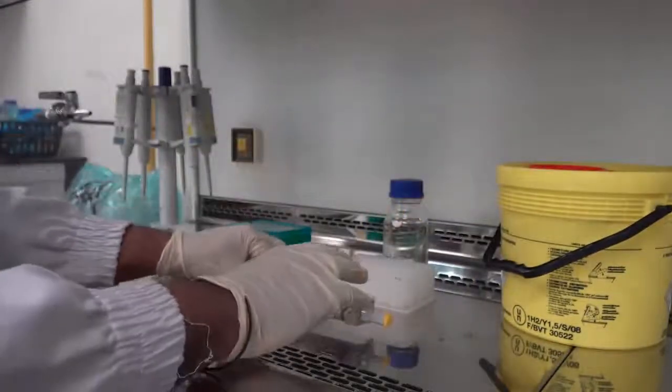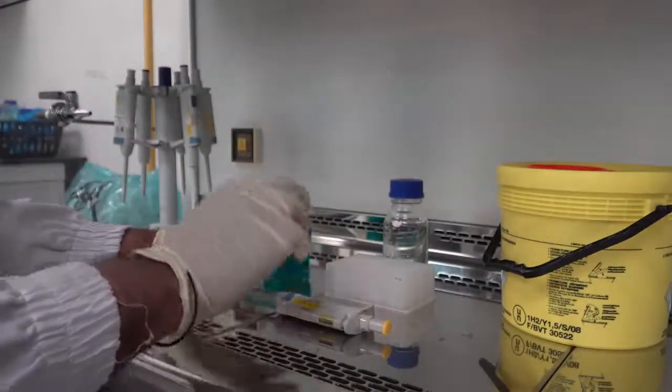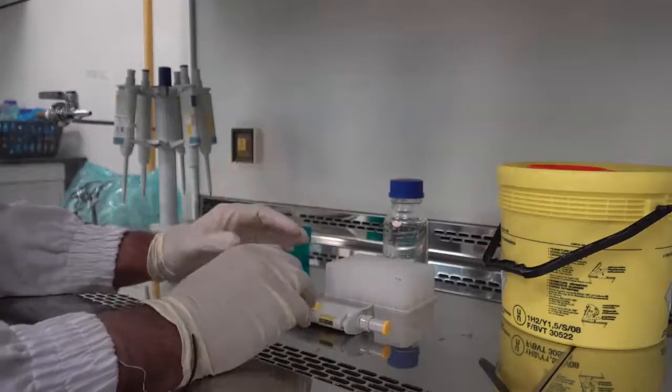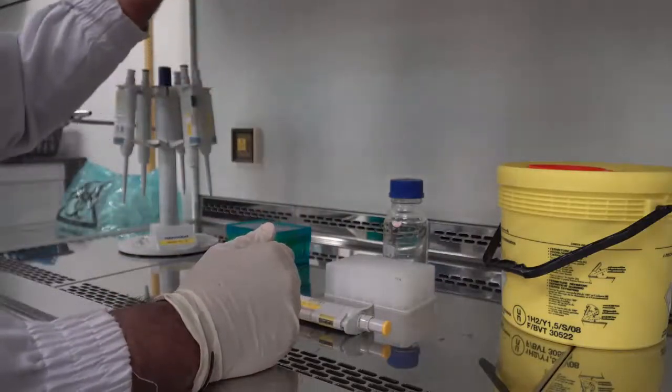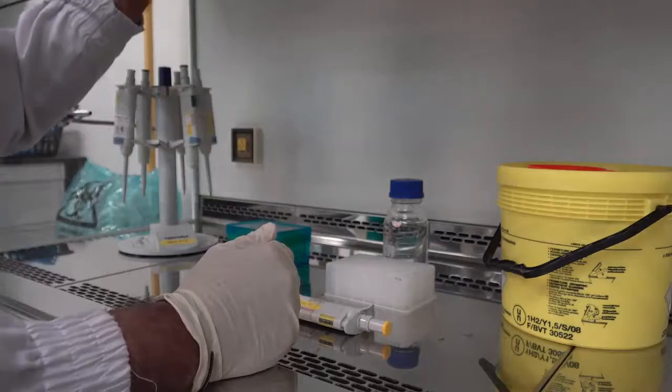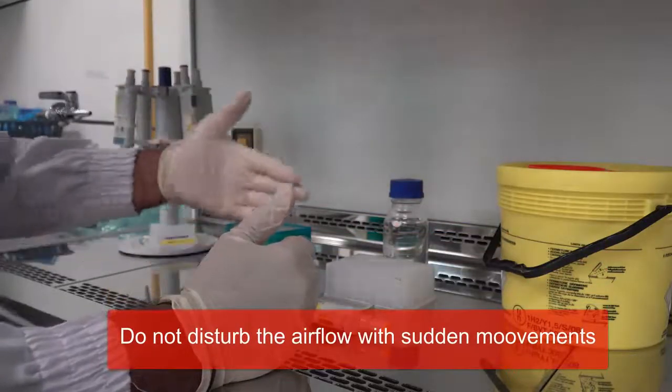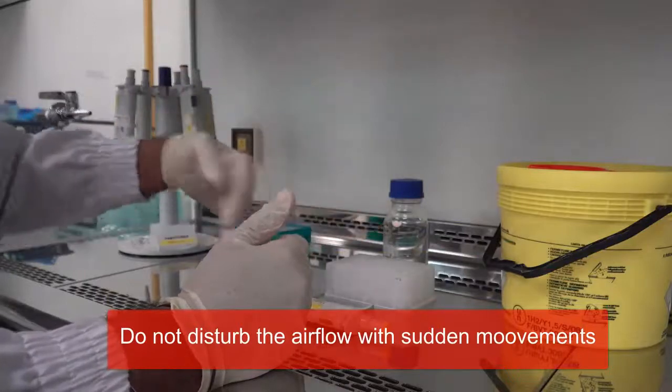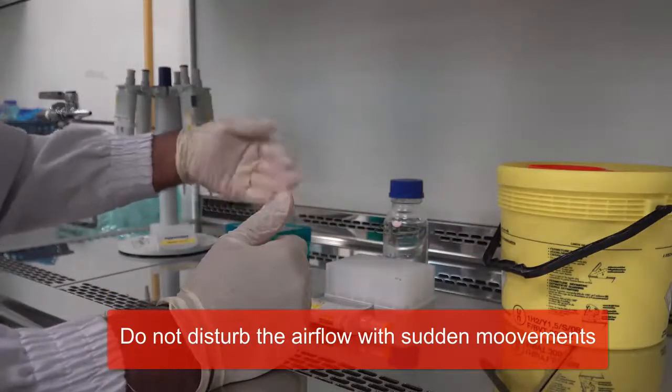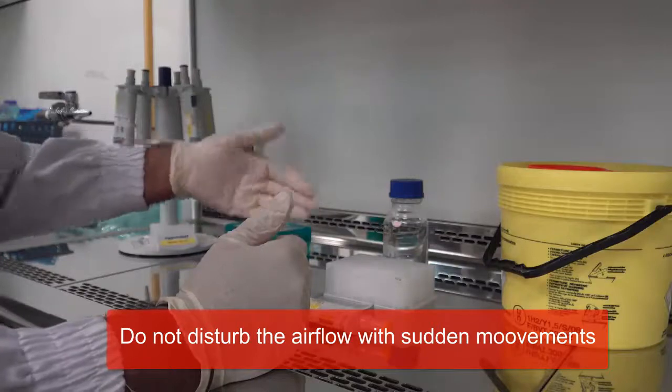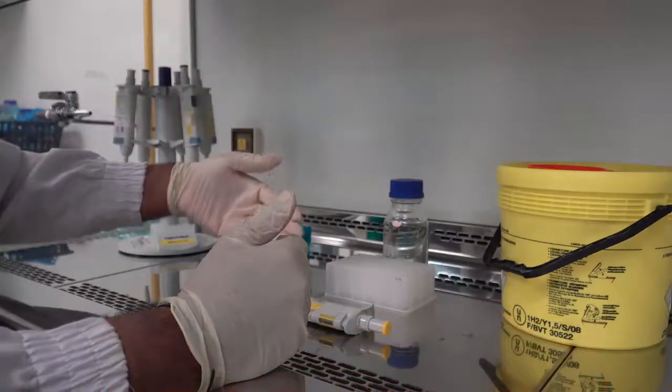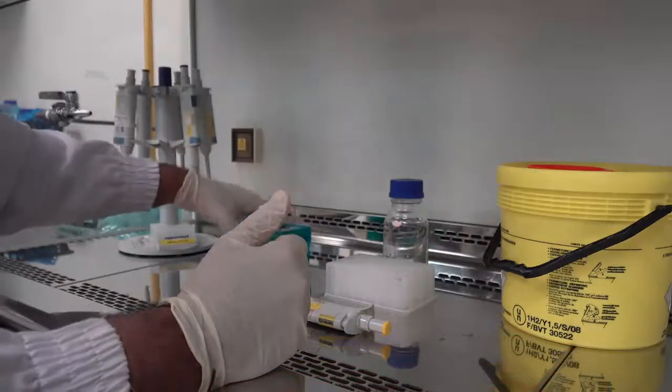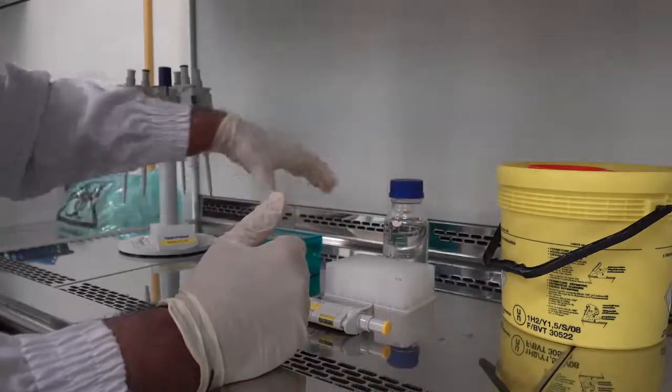There are some tips which one needs to note when working in this biological safety cabinet. This region basically has a downdraft of air which protects me as the operator from this sample as well as protects the sample from any kind of contamination which may be produced in the environment. This is why we work within this zone.